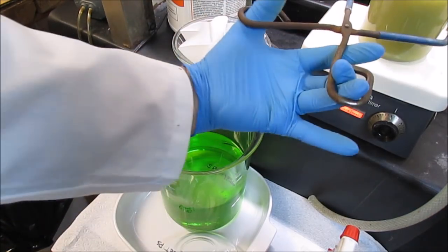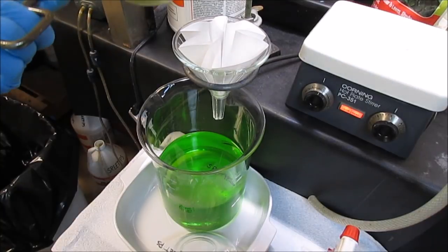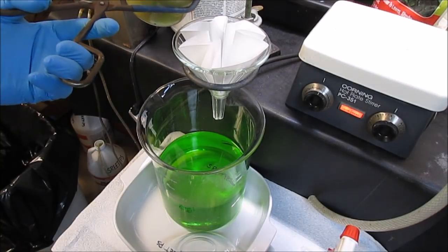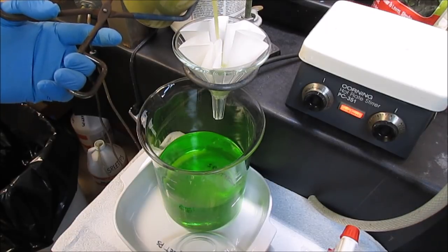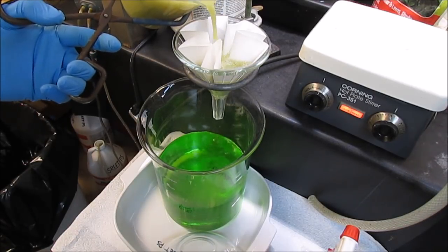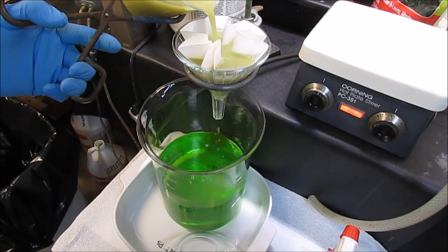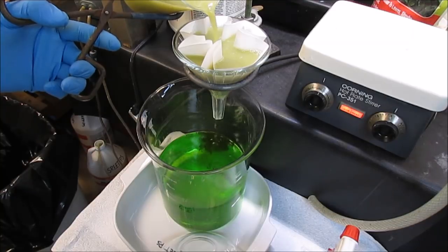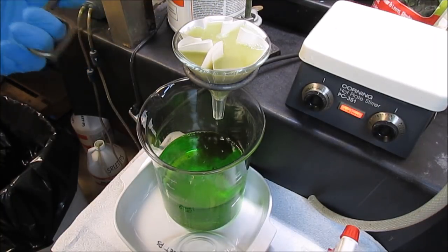Now what I'm going to do is take the saturated solution of copperas and carefully pour it into a filter here. This has to be filtered because it does contain little bits of iron that, if they're not filtered out, will get into the gold and contaminate the gold. So it's important to filter the copperas solution before we add it to the gold solution.